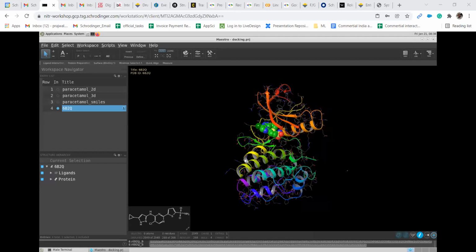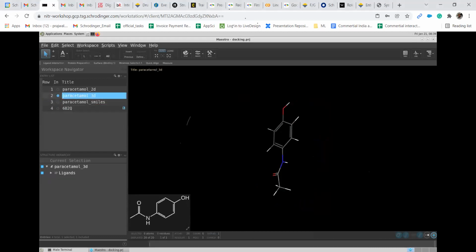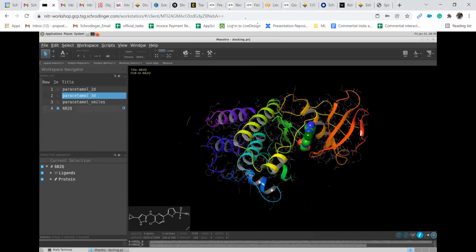Those steps are, to perform molecular docking, as explained by Dr. Pritesh in the presentation, you need to have a biomacromolecule. That's your protein structure. You can have the protein structure from the Protein Data Bank or any other database, and you can use it for molecular docking. In the same way, the protein is called the receptor, and then you have a small molecule. A small molecule is just like a paracetamol structure which you have drawn. In the same way, you will have a lot of different small molecules which act as drug molecules, and you can use those for the process of molecular docking.